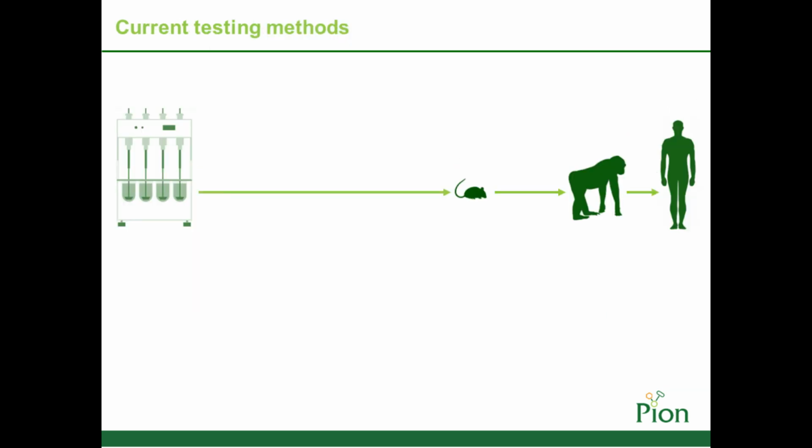All drugs that will eventually hit the market to treat patients will normally go through thorough testing in order to ensure efficacy and safety. This normally involves many different testing methods, as often it takes a very long time before the drug eventually gets to the patient that needs it. However, there is currently no standard in vitro practice imposed for testing of subcutaneous formulations.